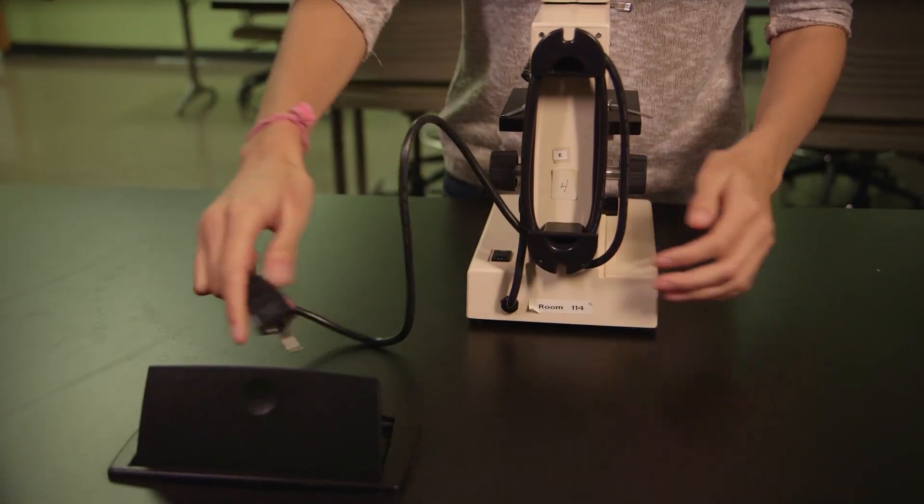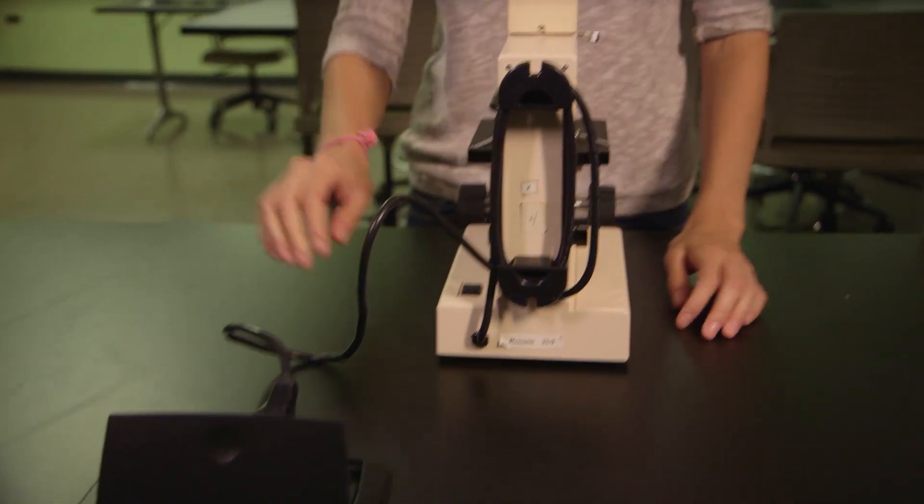Unwind the cord and plug it into the outlet at your table. If the light does not work, check to be sure that the table is plugged into the wall outlet.